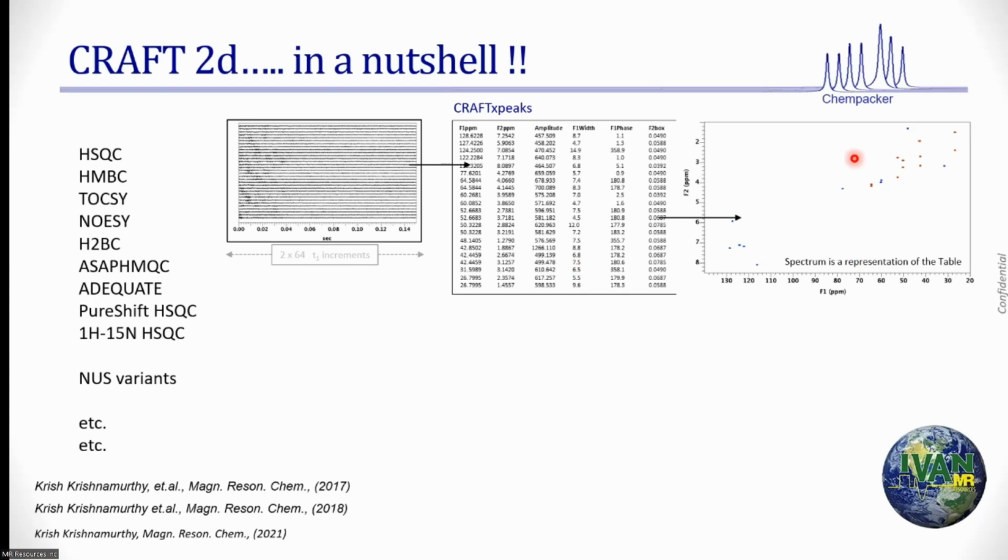So I did not throw away the noise. I just represent the noise differently, which is the uncertainty of measuring that frequency. Nothing more, nothing less. So there's no T1 noise here. T1 noise came because you did an FT, not because it was something real. You did an FT of the uncertainty, which is the top trace in the three trace picture that I showed you. Right?